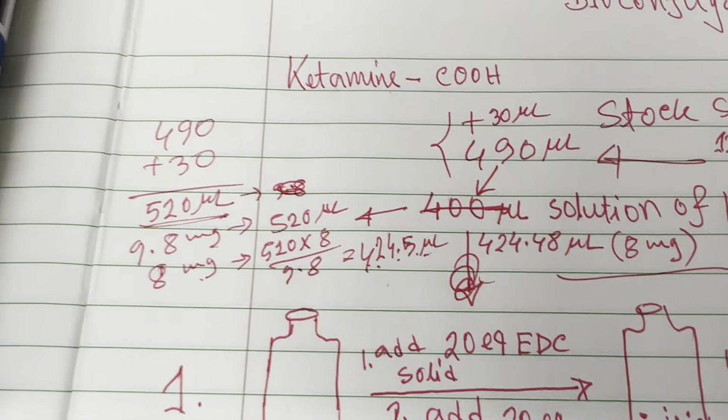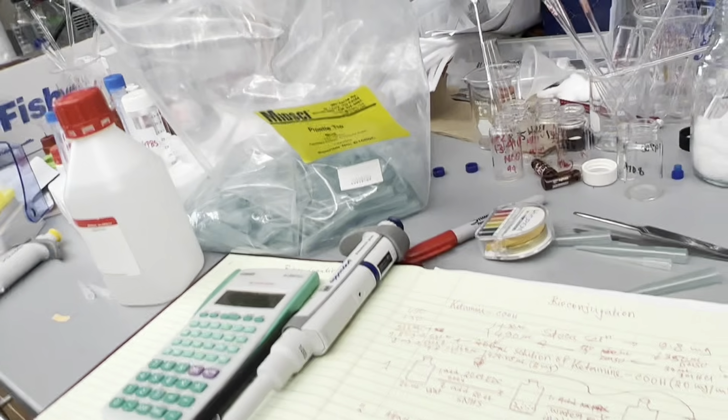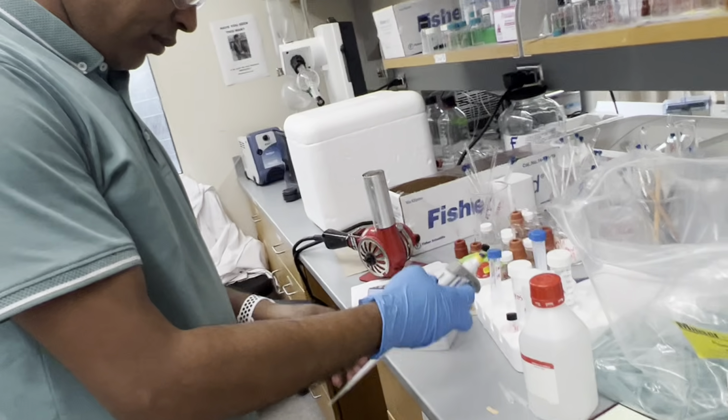So did you grab the 424.5 yet? No, not yet. Okay. So we are making this solution, and then after this we're going to make the sulfo-NHS, and we are going to measure those amounts. And then we'll go to the biosafety cabinet. Okay. All right. Gotcha.